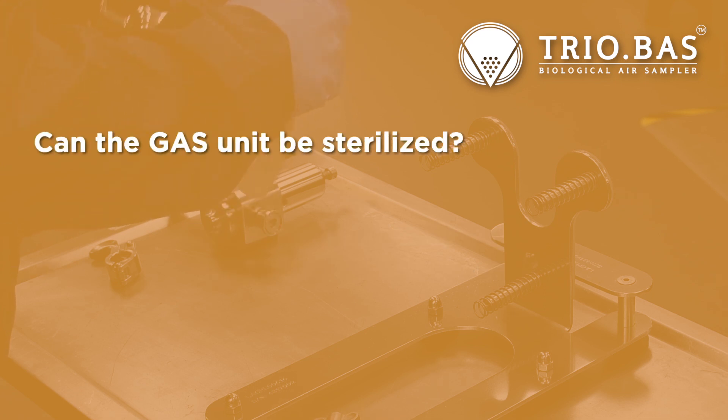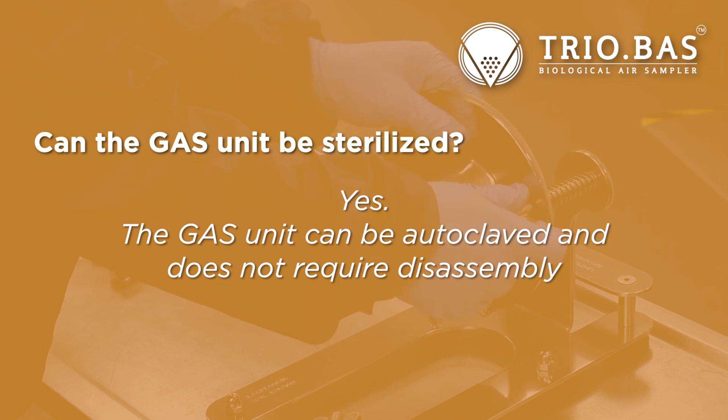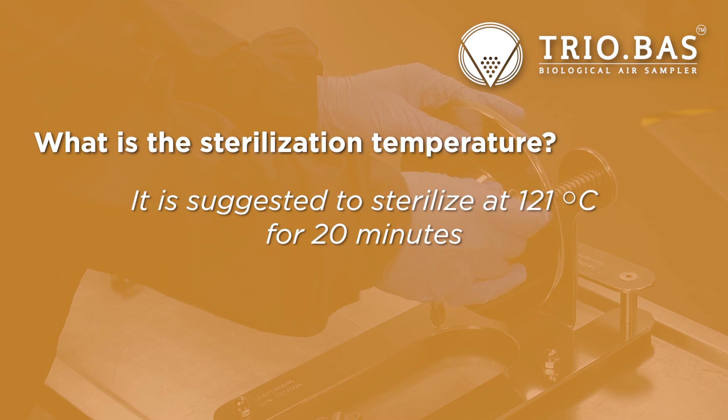Can the gas unit be sterilized? Yes. The gas unit can be autoclaved and does not require disassembly. What is the sterilization temperature? It is suggested to sterilize at 121 degrees Celsius for 20 minutes.